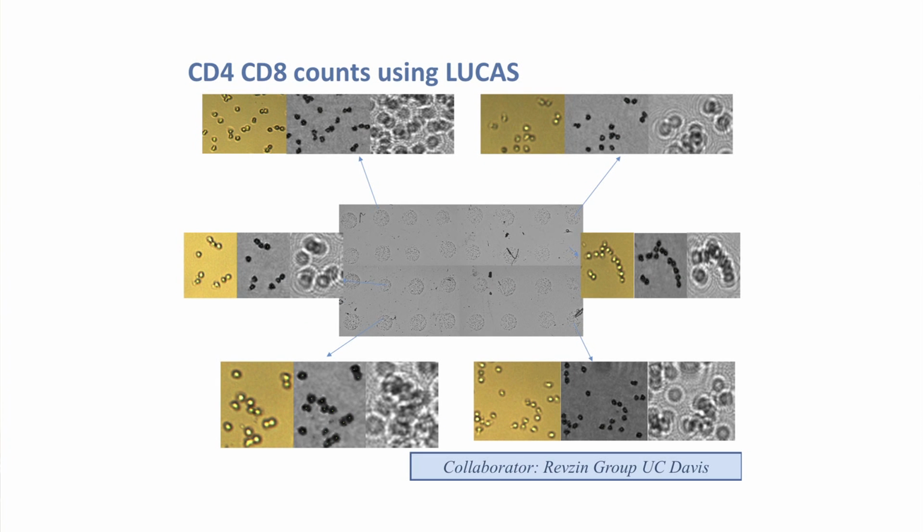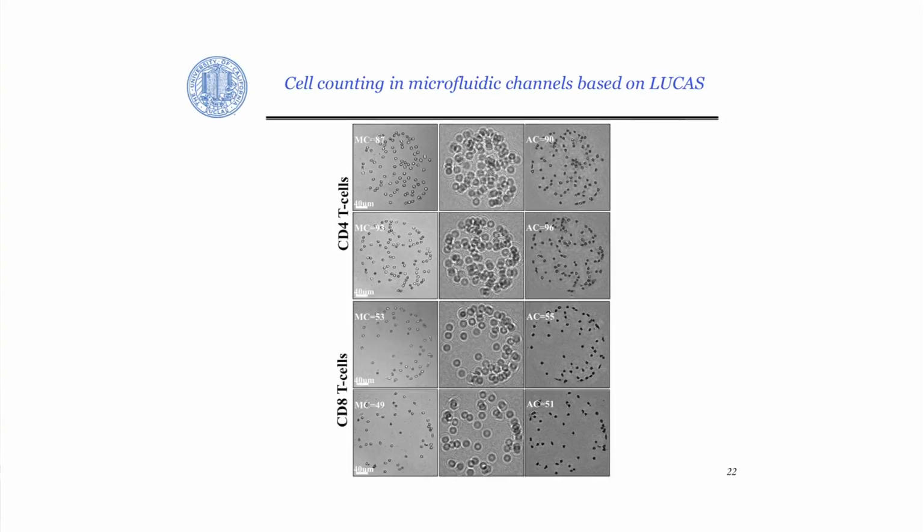For instance, this is looking at one of these microfluidic devices, imaged using a lens-free microscope as shown. And maybe because of the poor contrast, you won't be able to see this, but there are microspots here. Each one of these microspots, if you zoom in, will show you these holograms. Then you reconstruct and get the cells, which are then counted per spot. On the same chip, these are the zoomed-in images. There are CD4 antibody spots and CD8 antibody spots.